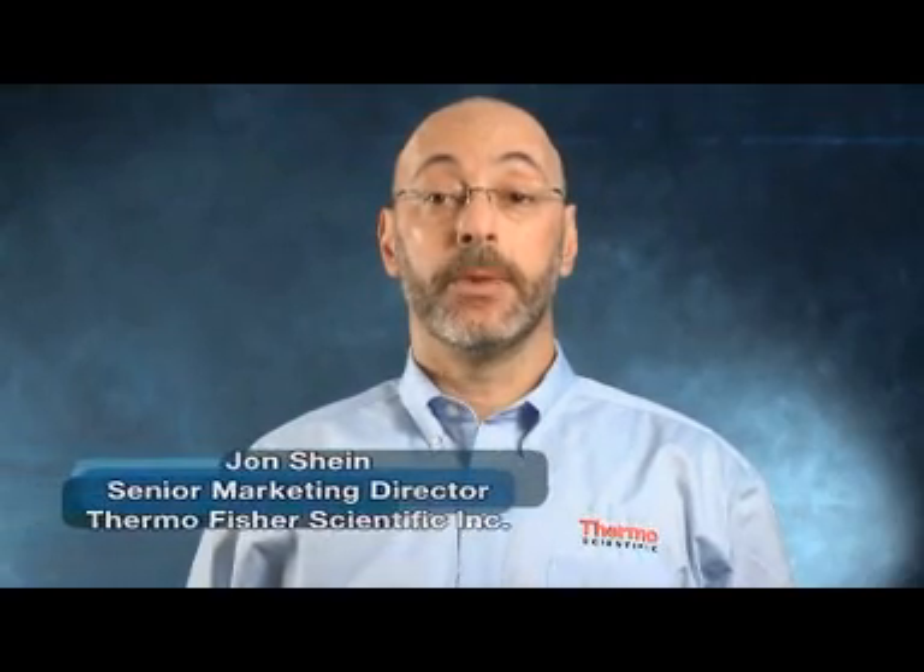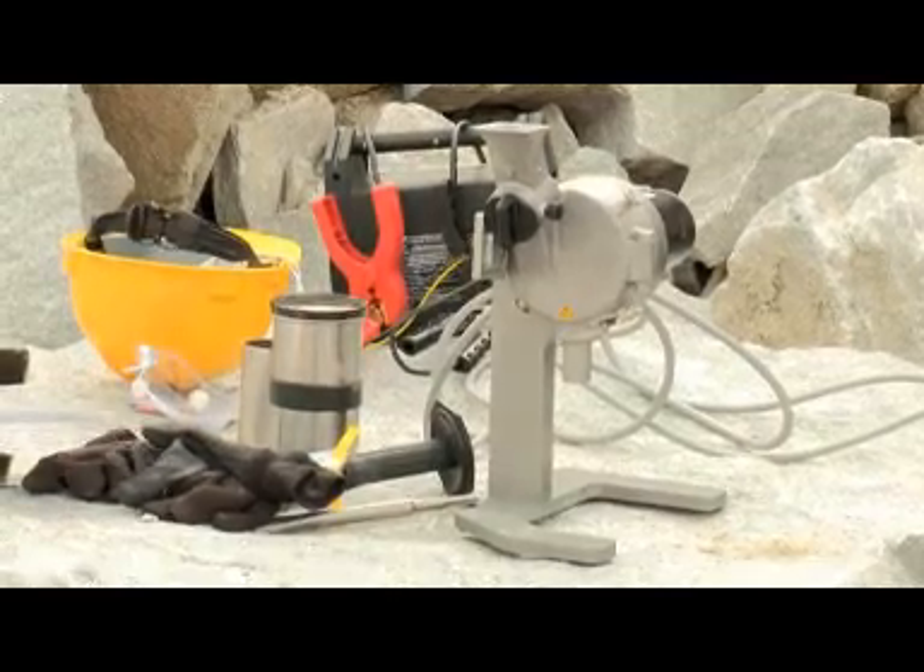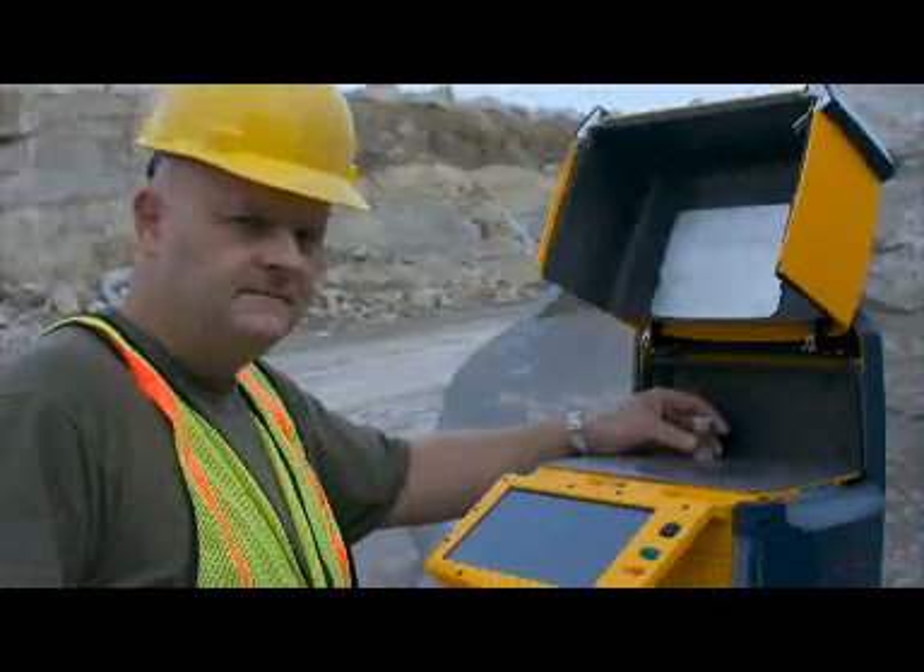In our continuous efforts to help bring the lab to the field, we are pleased to present the first ever 12-volt hammer mill field kit. Within minutes, you can easily prepare your samples to generate lab quality data where and when you need it. I will let my colleague, Mr. Mark Duparat, demonstrate this for you.